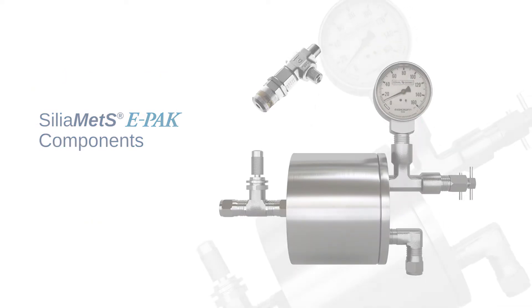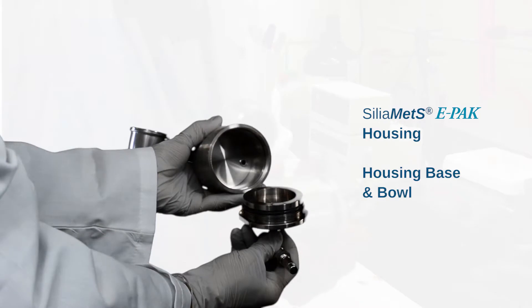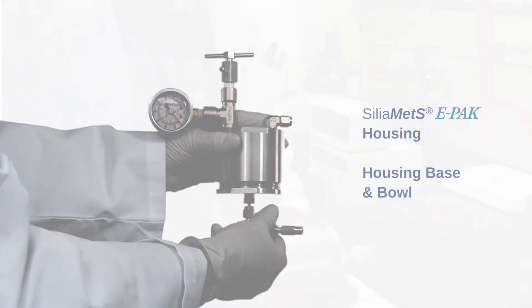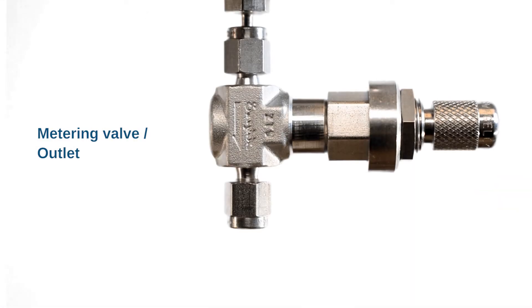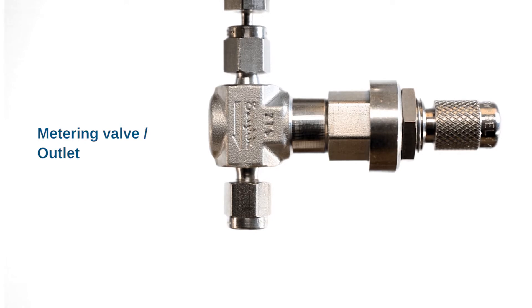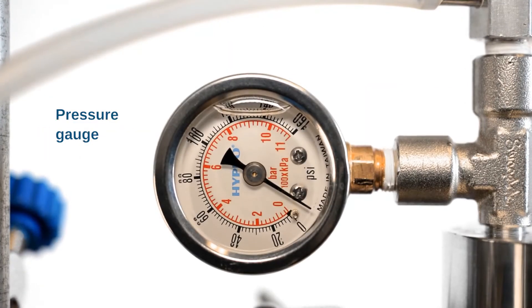SiliaMet E-PAK components: SiliaMet E-PAK housing, housing basin bowl, metering valve outlet, pressure gauge.